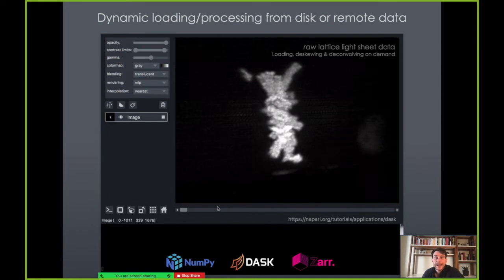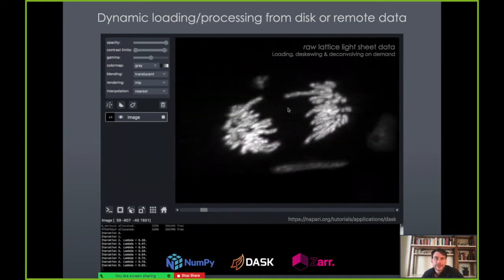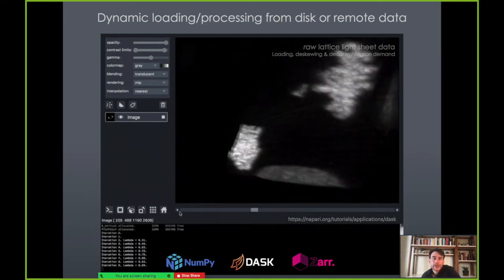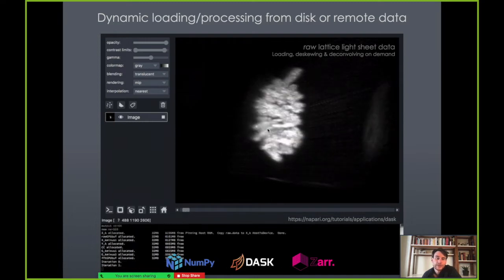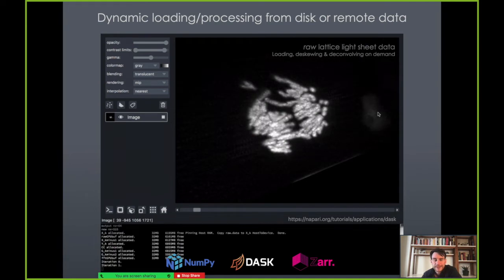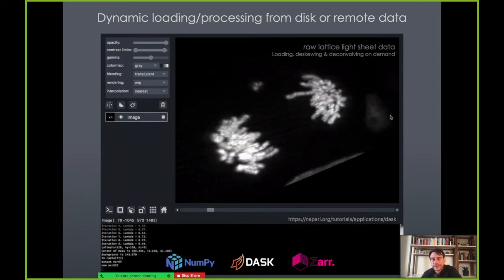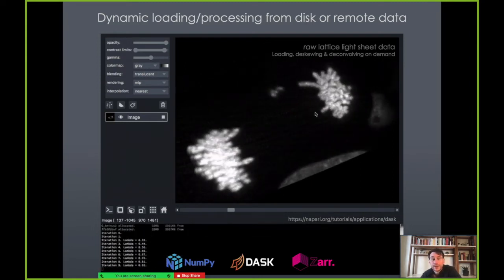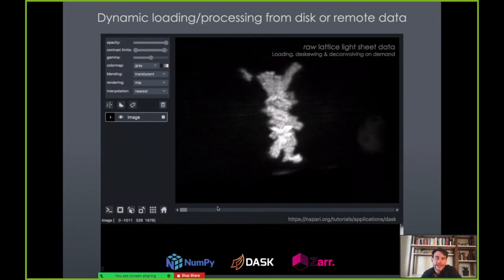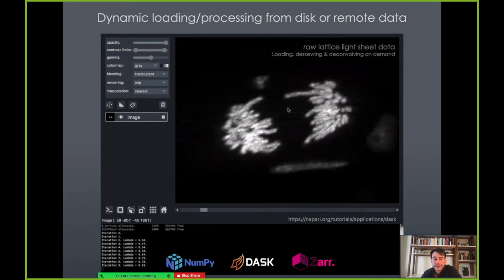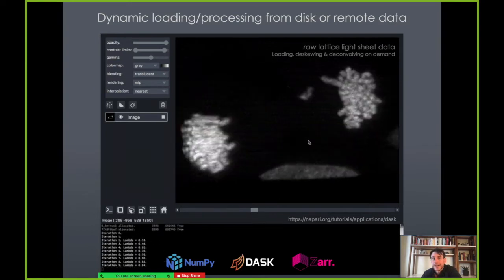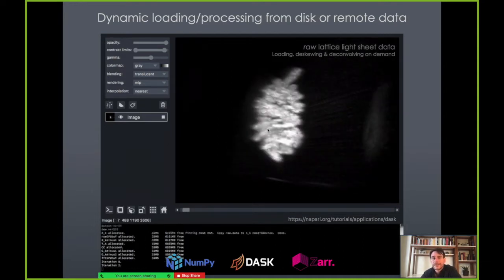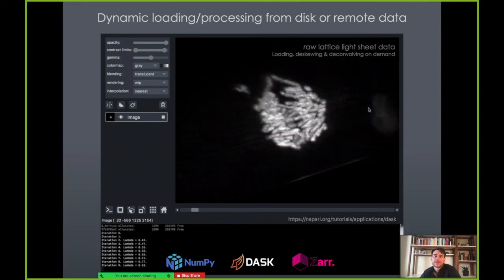We can also do dynamic loading and processing from disk or remote data. In this example, we have raw lattice light sheet data that is being loaded and then de-skewed and de-convolved on demand. Every time the dimension slider moves — in this case representing time, since it's a time series — we're loading in 3D data and then de-skewing and de-convolving on the fly. This means you don't have to have a second copy of the dataset; you can keep the raw data and do the processing on the fly when you need it.